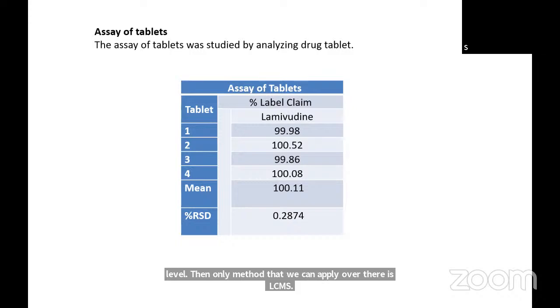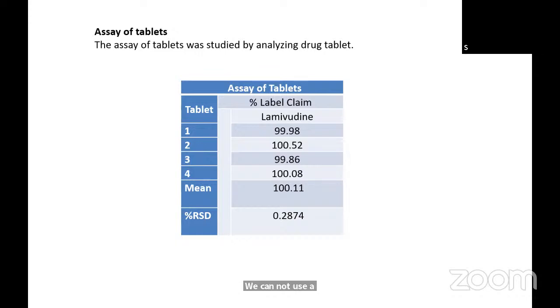We cannot use NMR for such an analytical protocol, because the sample has to be concentrated up to at least 1 milligram level. For proton NMR we usually take 5 milligrams for analysis. We can go down to 0.5 milligrams, not below that. That is the limitation with qNMR.